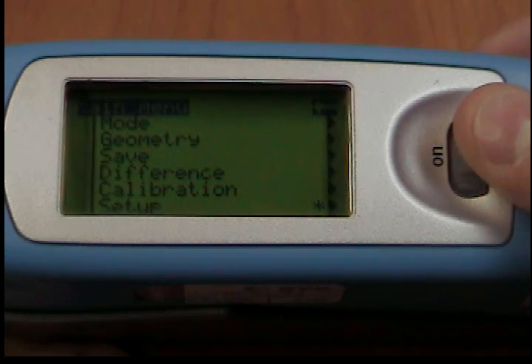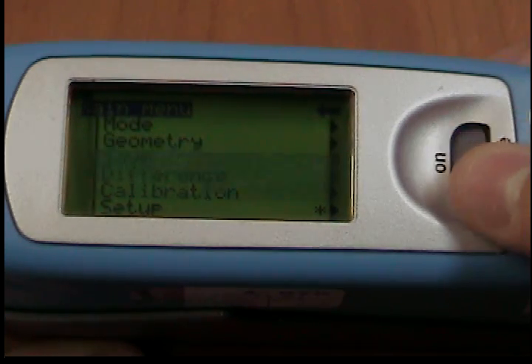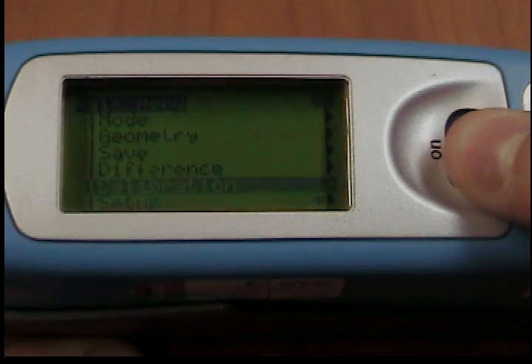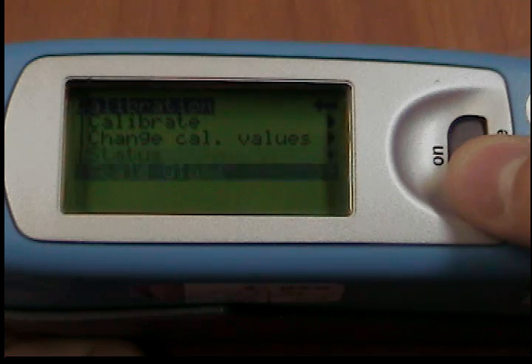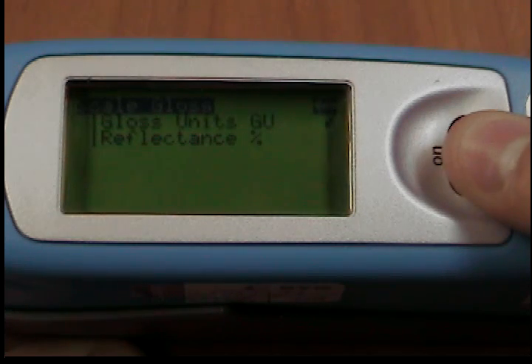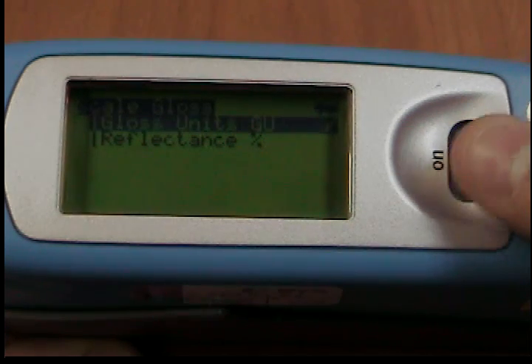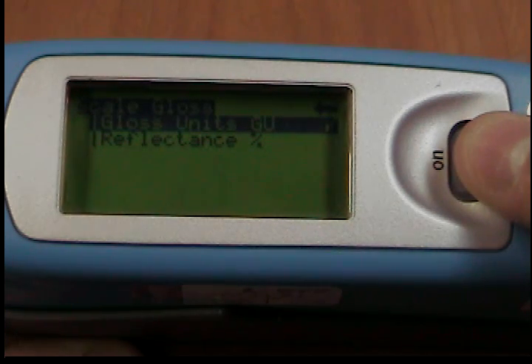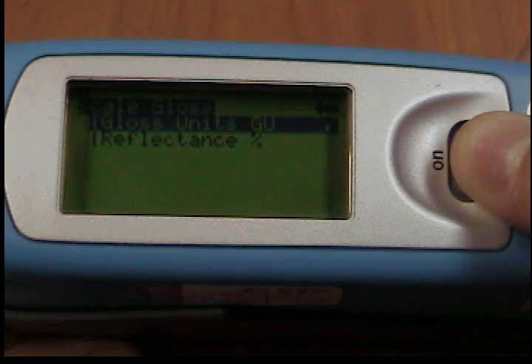Scale. You can use the Scale menu option to switch back and forth between gloss units and reflectance. Move the mark to the desired entry and press Mode. A check mark identifies the scale that is selected. After you switch the scale, the unit must not be recalibrated.